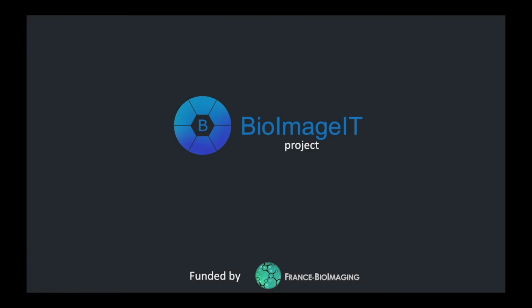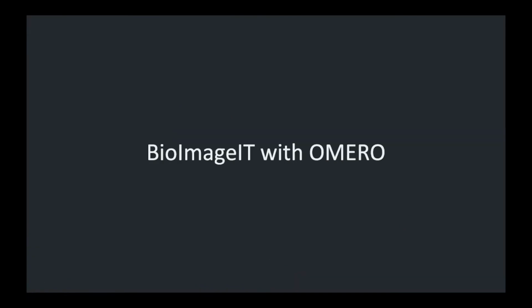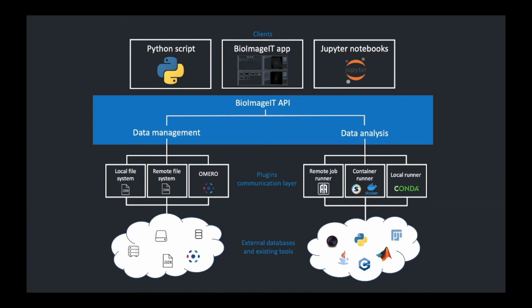In this BioImageIT tutorial, we are going to see how to use BioImageIT with OMERO database. As a reminder, I want to show the BioImageIT project architecture. The main component of BioImageIT is the application programming interface, a single interface that allows communication with the components, the data management and the data analysis. And each component is implemented with plugins.